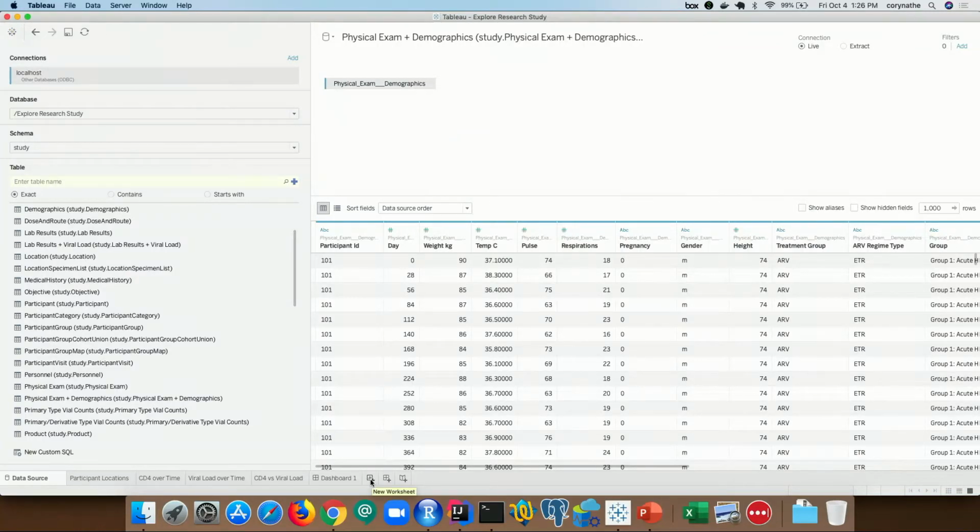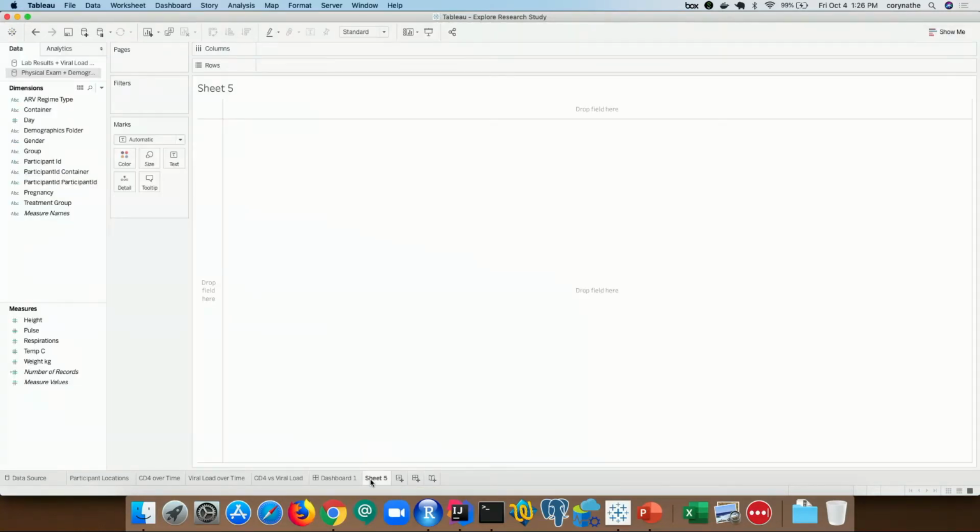Just to very quickly then replicate that box plot, for those of you who might not have seen Tableau before, an example of how that works. So again, if I go over to creating a new sheet in my Tableau workbook, I can select from the various different columns available in that data source I selected.